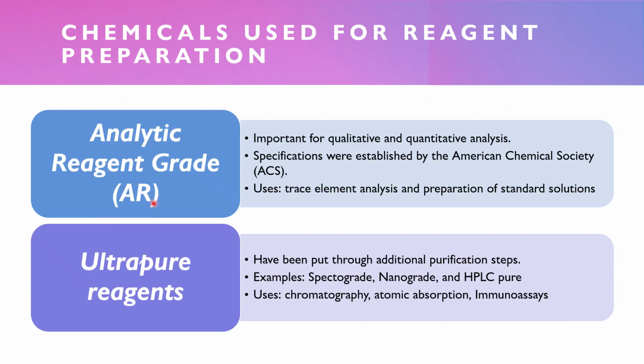Analytic reagent grade chemicals are also very important for qualitative and quantitative analysis, and are used for trace element analysis and preparation of standard solutions.